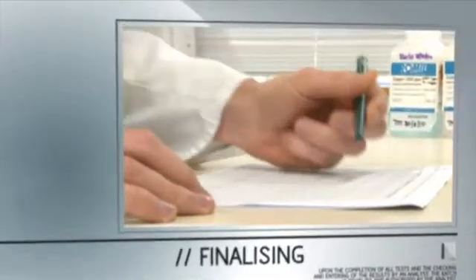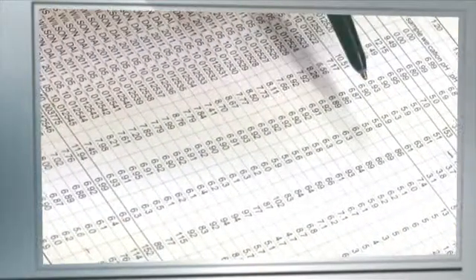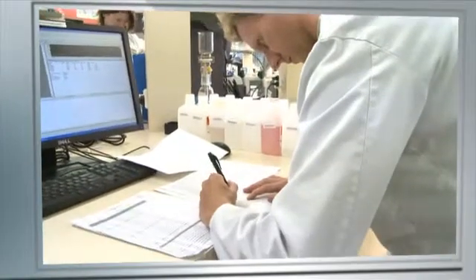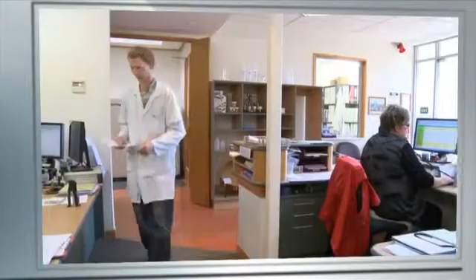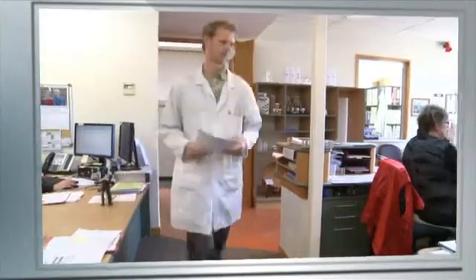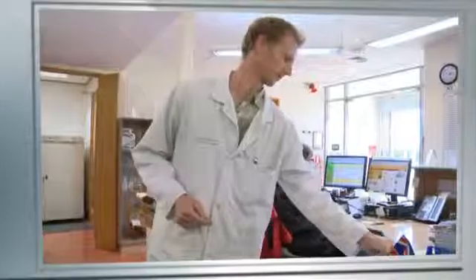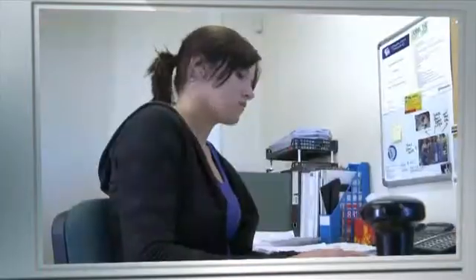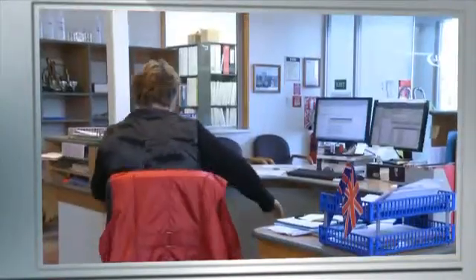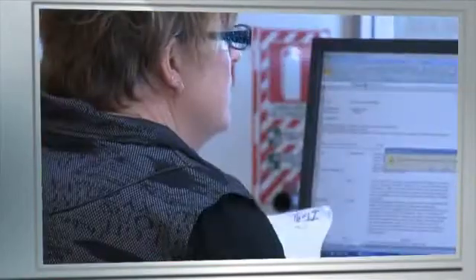Upon completion of all tests and the checking and entering of the results by an analyst into Sample Manager, the batch is reviewed and authorized by the analyst. The paperwork is then provided back to the administration area, whose personnel process and send the final soil reports back to you. Once your sample is received, the overall soil sampling process typically takes 4 days, 6 days if an Australian sample.